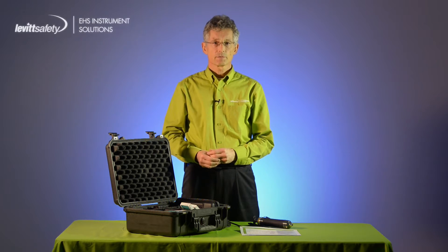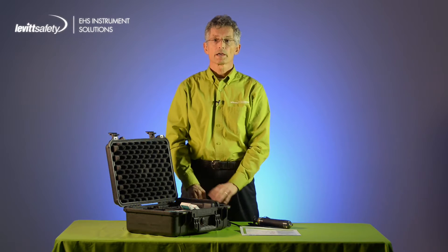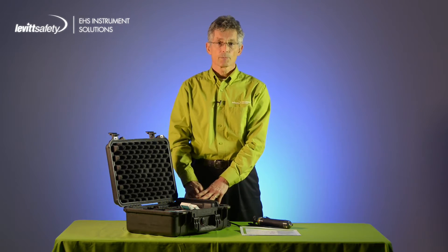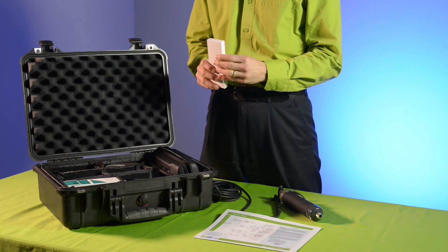The GASTEK tube kit has several advantages over electronic instruments. Unlike electronic gas detectors, GASTEK tubes do not require calibration and can be stored on a shelf or in a vehicle until ready for use. As long as the shelf life of the box of tubes is not exceeded, the tubes are ready for use.